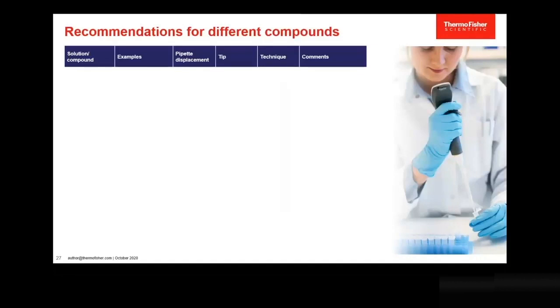We have recommendations for different liquids. For aqueous solutions, buffers, diluted salt solutions, etc., use an air displacement pipette with standard pipette tips and use the forward pipetting technique.